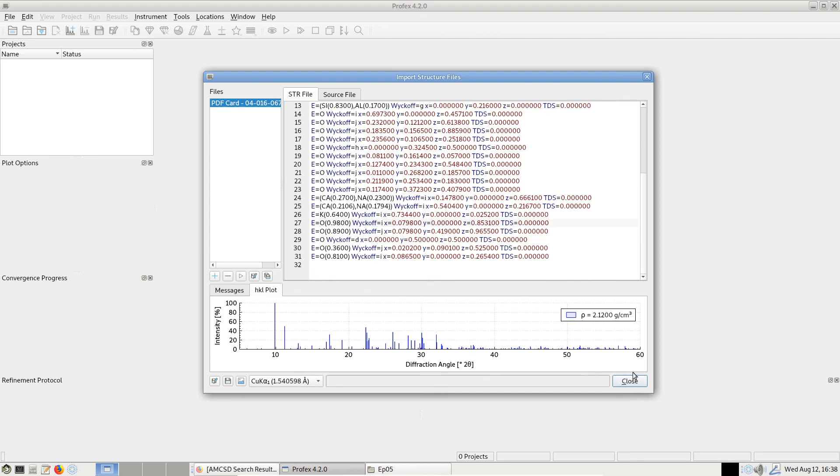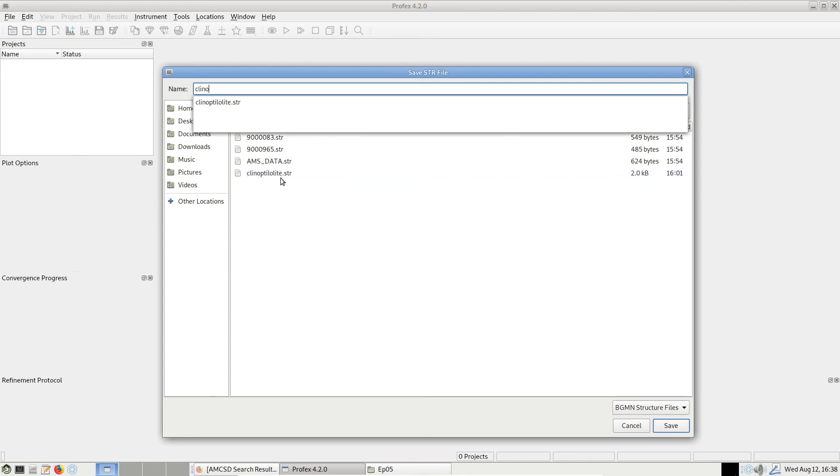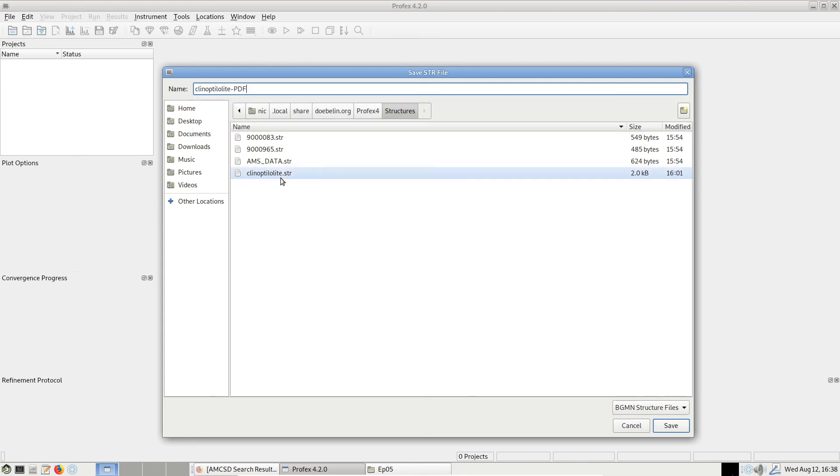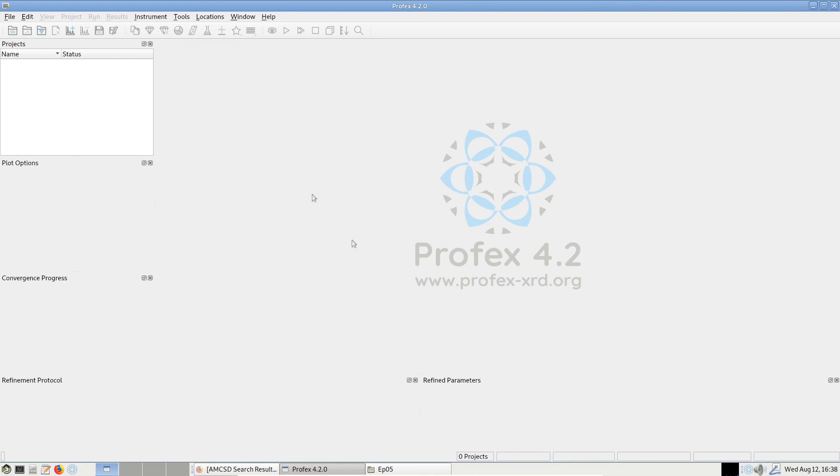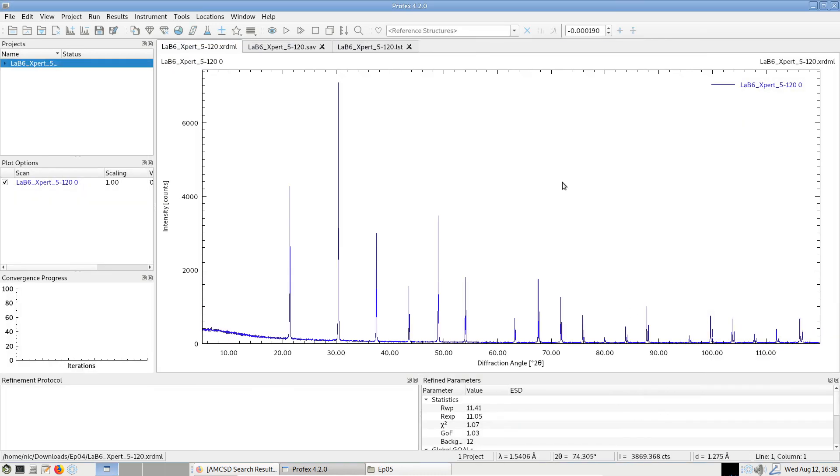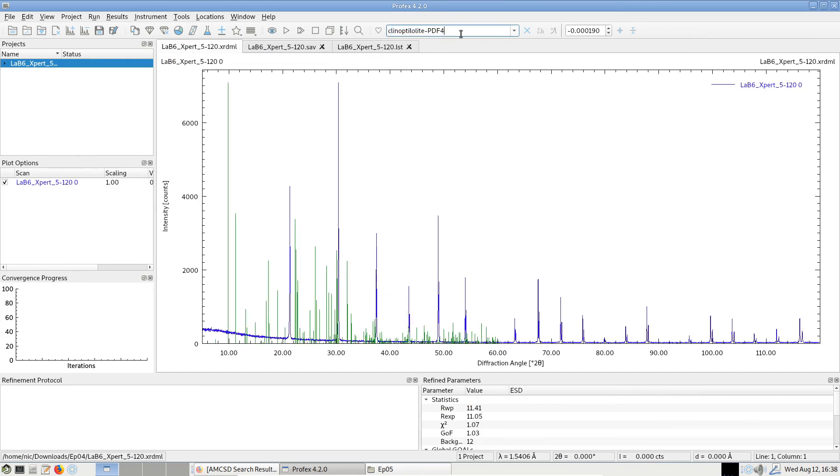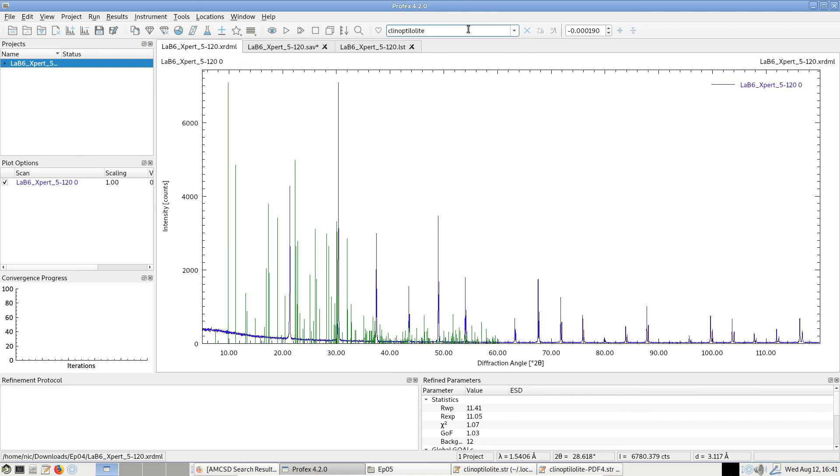When we close, now we have to save first. Let's call it Kleinoptilolite PDF4. And when we close, this one will be indexed as well. And if we open a structure file and we search for Kleinoptilolite, we can find the one from the PDF4 and the one from the COD database. If we switch back and forth between the two reference structures, we can see differences in the HKL line pattern.